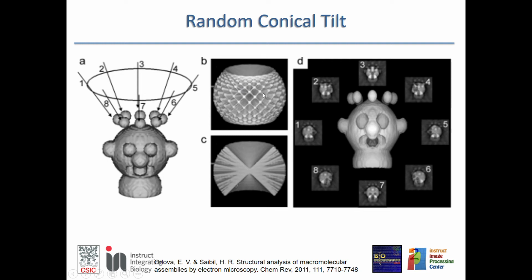In this cone there is no information, and the effect of that missing cone is an elongation along the direction of the missing cone.